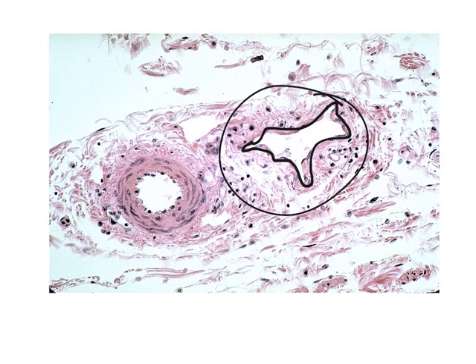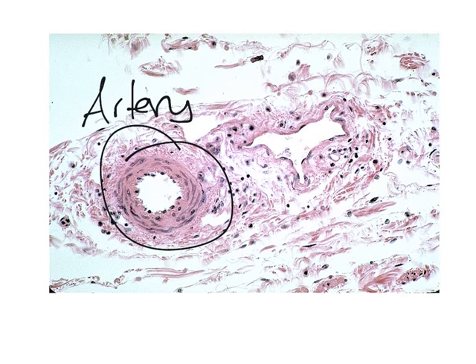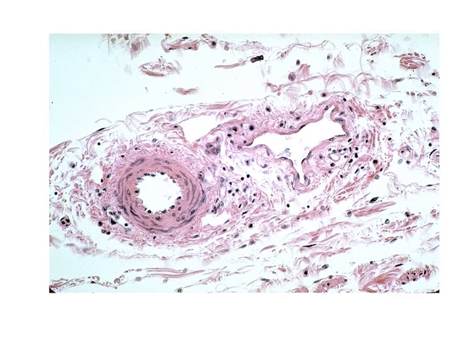So you can definitely see the difference between these two. The artery has to withstand high resistance from the blood, and the vein just kind of is this floppy little thing sending blood back to the heart.